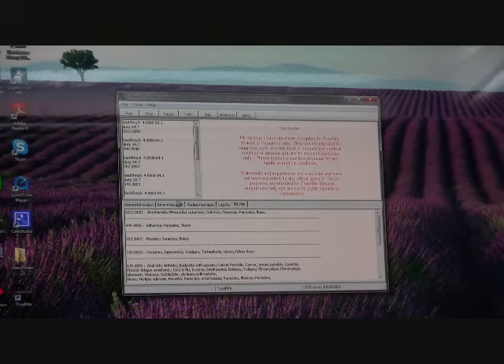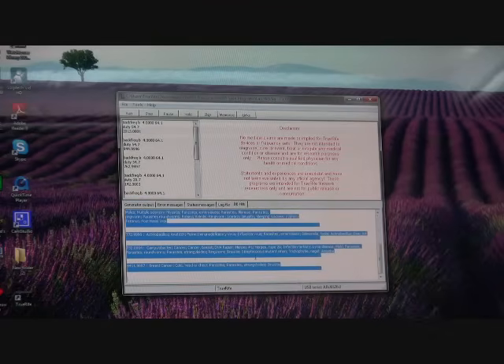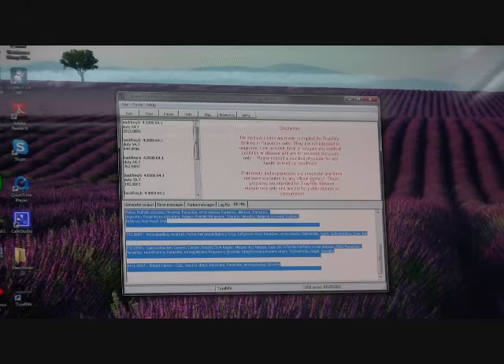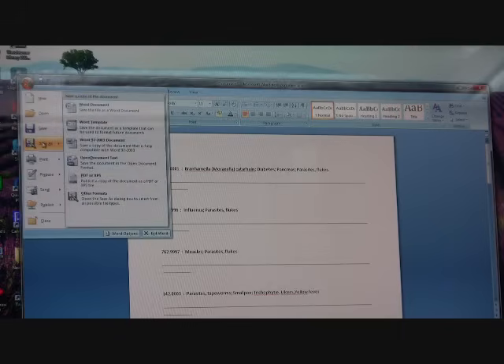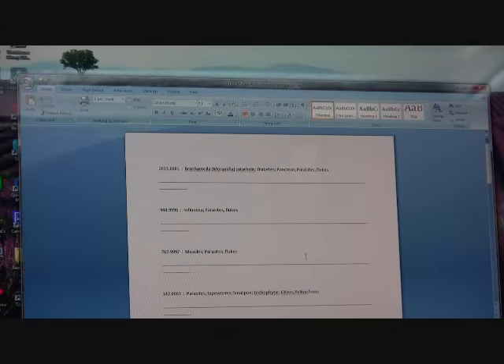If you want to save the database generated from the DB HITS tab, simply highlight everything in the box, right-click your mouse, and choose Copy. At that point, open up a word processor — in this case I'm opening Microsoft Office — right-click on the screen, choose Paste, and here we have our database displayed. Now click File, choose Save As, and save this list as our database of hits.